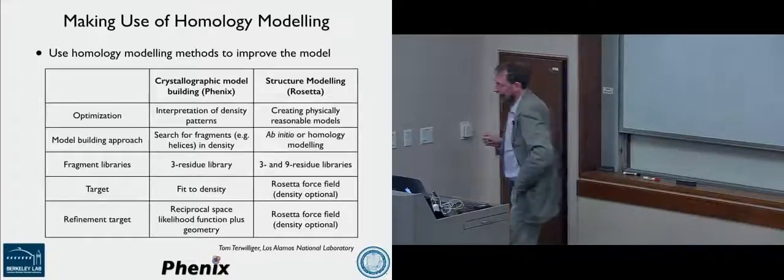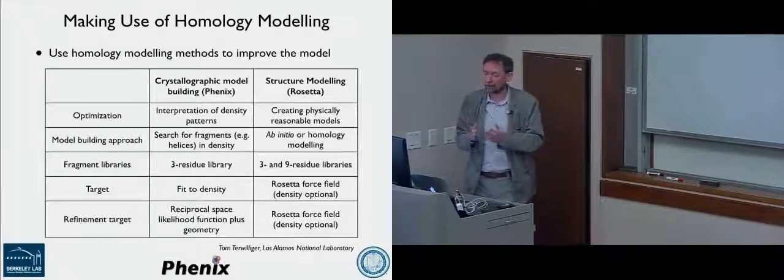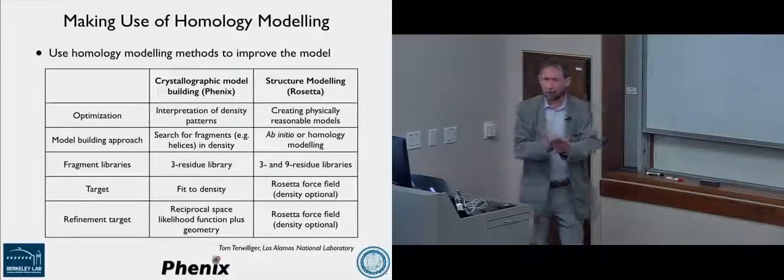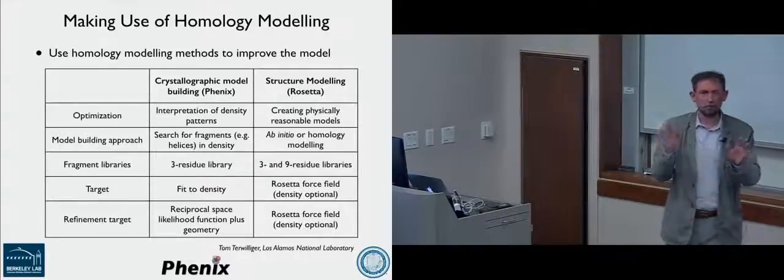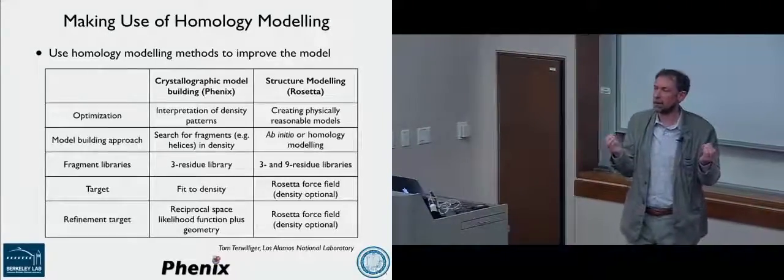So what Frank was interested in was, well, could we exploit the homology modeling aspects of Rosetta and combine that with molecular replacement with Phaser and everything else. So this is different from the ab initio model building. There's two components to what's done in Rosetta these days. One is trying to build models just given a sequence, which is a very good thing to try to do.